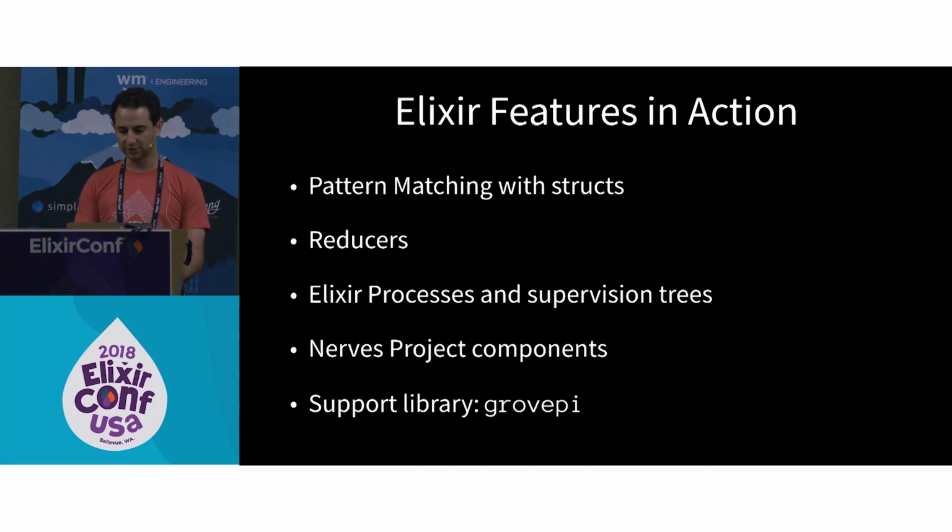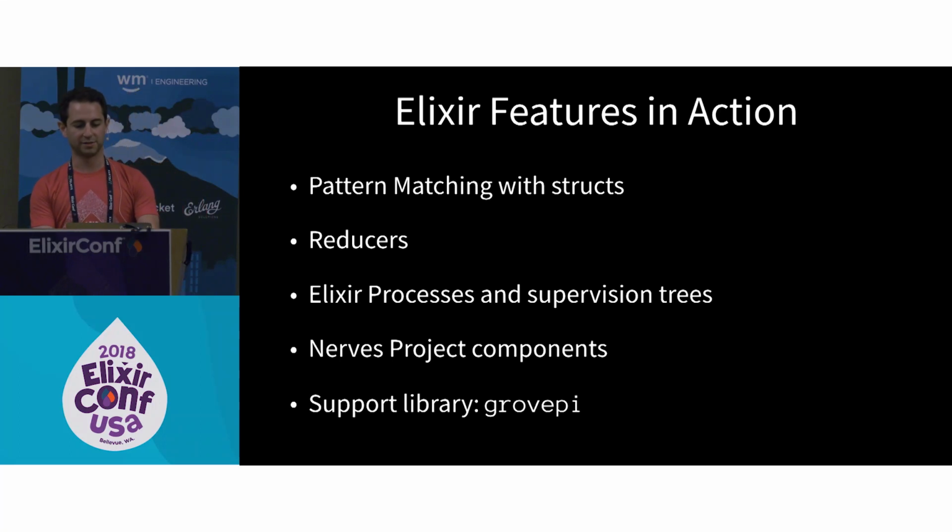So it's not a very complicated state machine, but there is a state machine that you can build with this setup. The way I did that was I used a struct to represent the sensor data that's coming in. GrovePI lets you implement triggers that basically notify processes that changes happen. So it's really easy to just read data, update it, and then send it to maybe a state machine that's powered by reducers to process the data and do the next thing that you need to do.